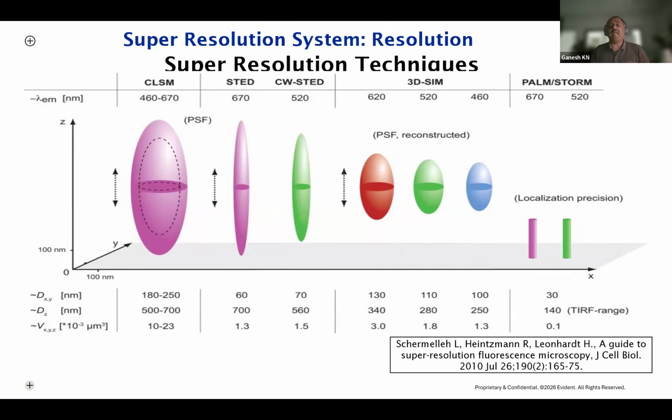You do optical sectioning, and you feel that at a specific region of interest, you are seeing some important structure that needs to be resolved better than a confocal microscope. You should be able to switch over to a super resolution microscope. So multimodality was also one of the most important criteria for super resolution imaging, where people should be able to switch from one technique to another as and when required.